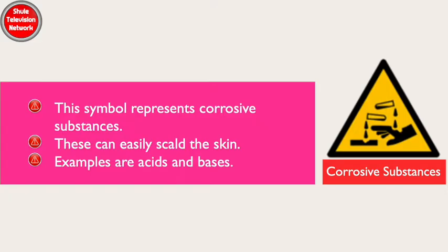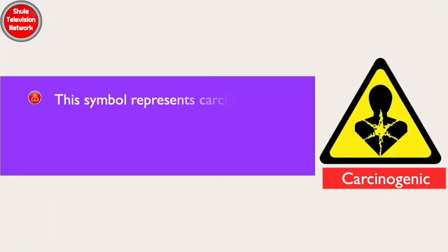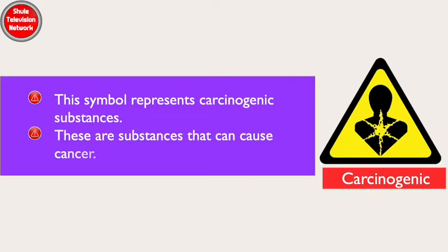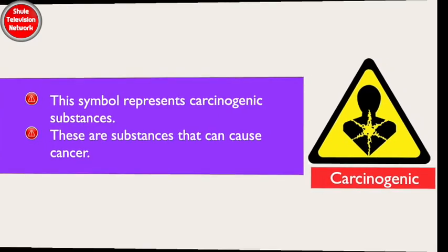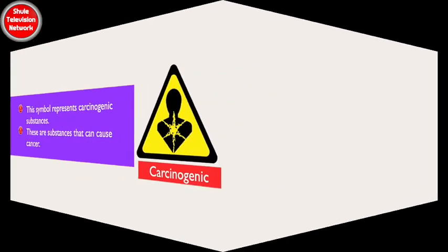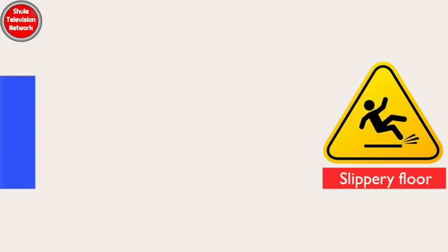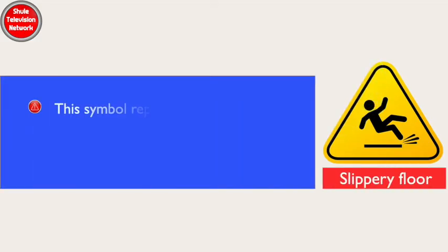This symbol represents corrosive substances. These can easily scald the skin. Examples are acids and bases. This symbol represents carcinogenic substances — these are substances that can cause cancer.